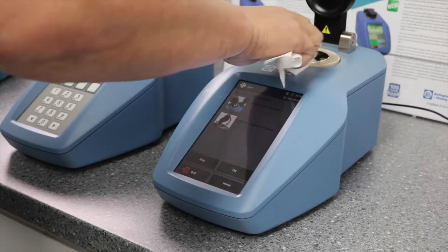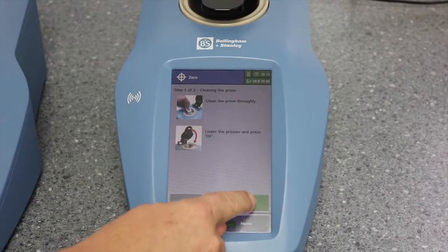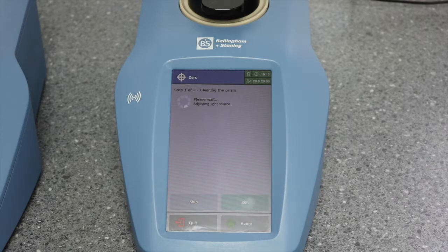Clean the prism thoroughly. Lower the presser and press OK. The instrument will now make a few simple checks.